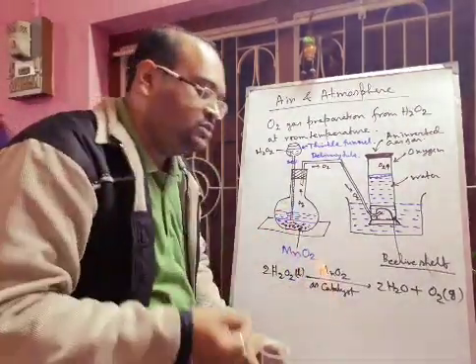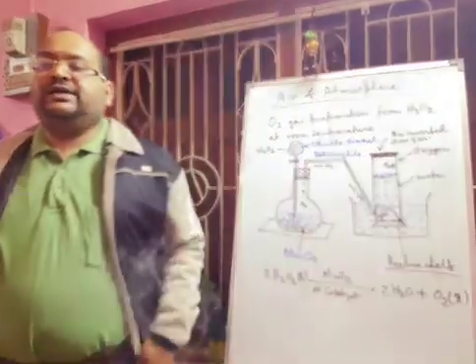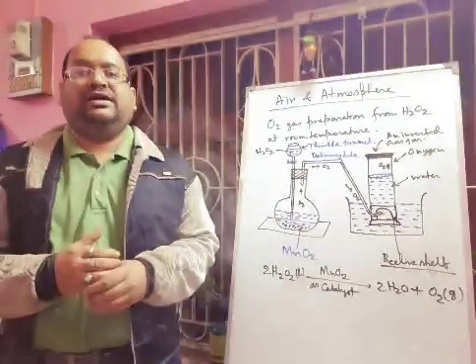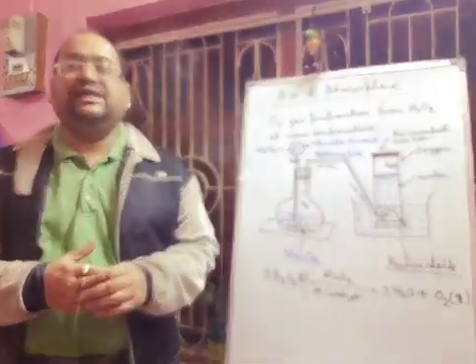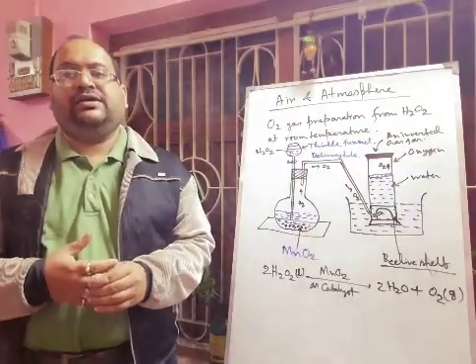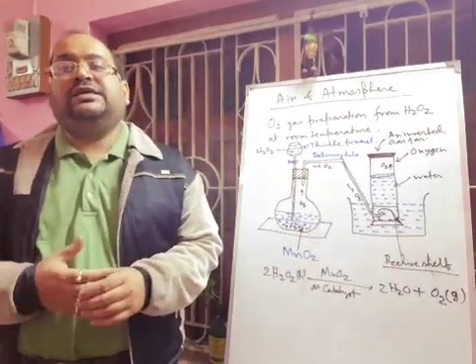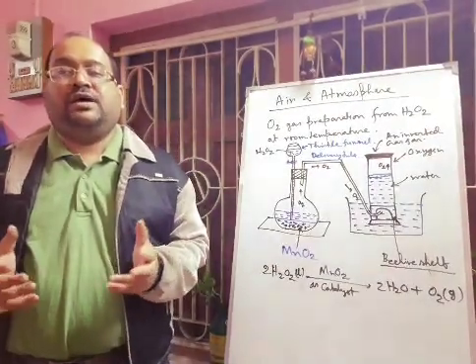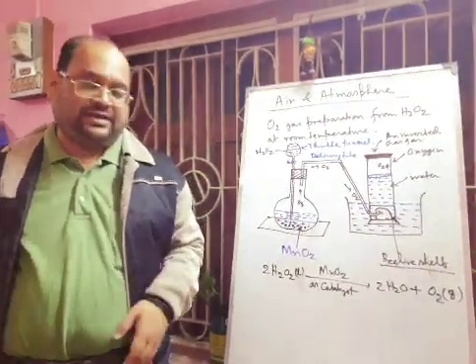So in this way we can easily prove that oxygen gas is not combustible, but it is helping in combustion. And what is your observation? The glowing splinter rekindles, but the gas does not catch fire.